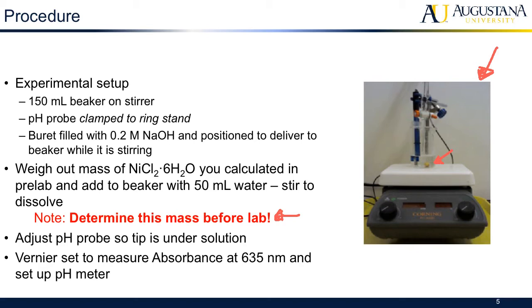So you're going to dissolve that, and initially that's in water, pH roughly 7, and so there will be no precipitate formed immediately. That's going to be a nice green solution once you dissolve the nickel into it.